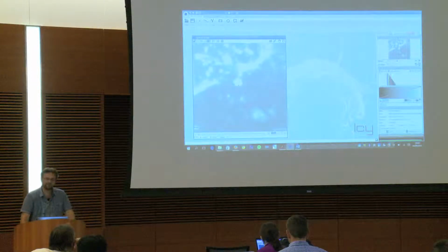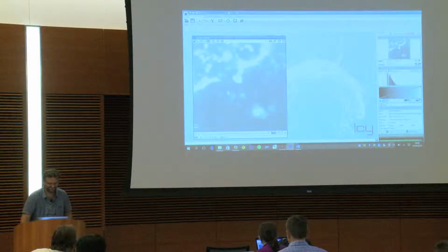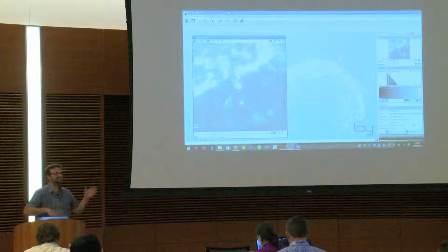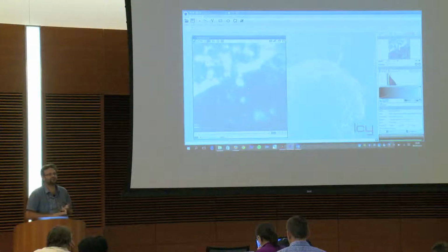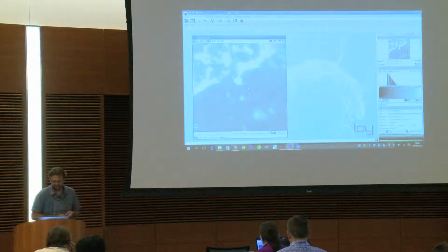Okay. If you are trying to follow up, this time it's going to be hard because I will click a lot. Okay, so here we have the vesicles. The target here is to be able to track each vesicle individually, because if we get the speed, we know which transport they are using. If we know the transport, we publish. Okay, so it's very simple.